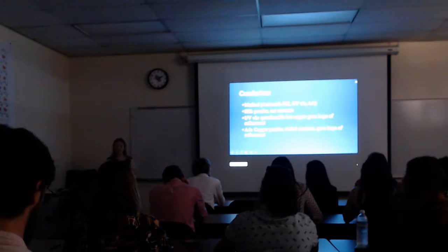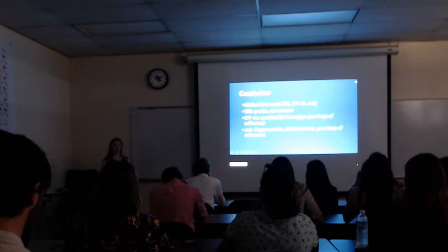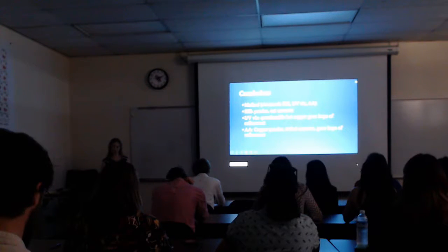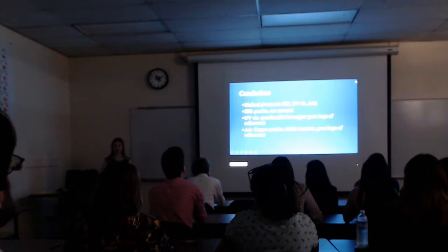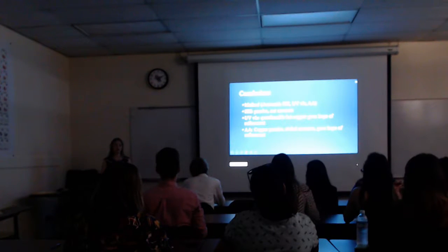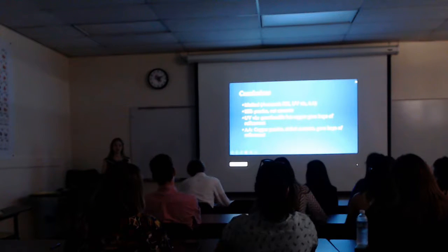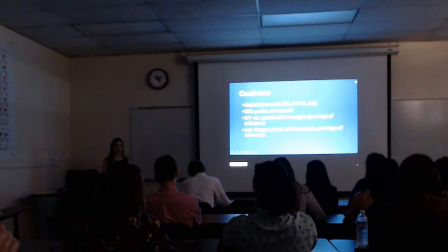And the UV-vis, we have hope of refining it, but the method itself will require more work and looking into. While the AA had both precision and accuracy depending on its metal. So we have hope that these methods can actually be refined, that they can actually be used to determine what type of clay is being used.